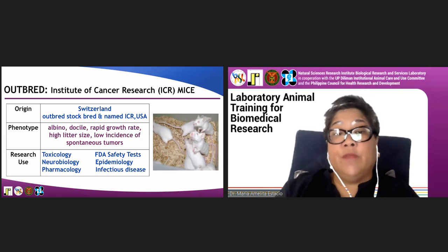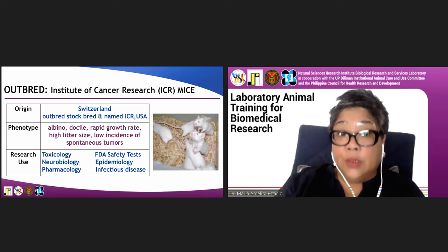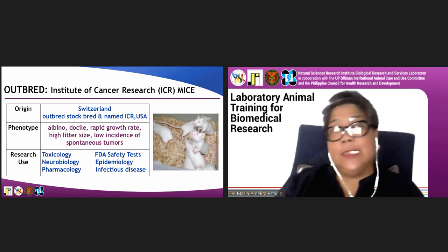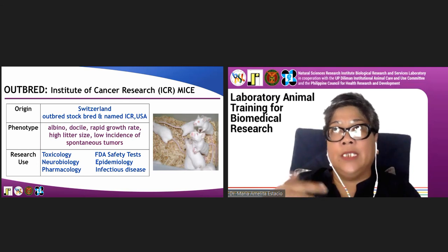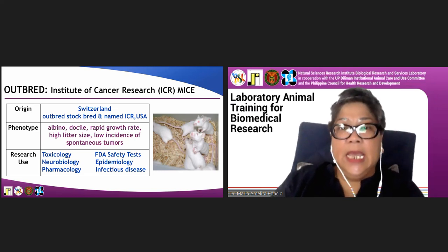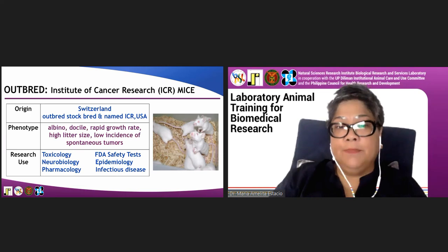So in terms of their usage, ICR mice are commonly used for toxicology research. If you're doing all those safety tests that are required by the FDA, such as the oral toxicity testing, whether it's acute, subchronic, or chronic, and systemic toxicity testing, then the ICR mice is a good choice.